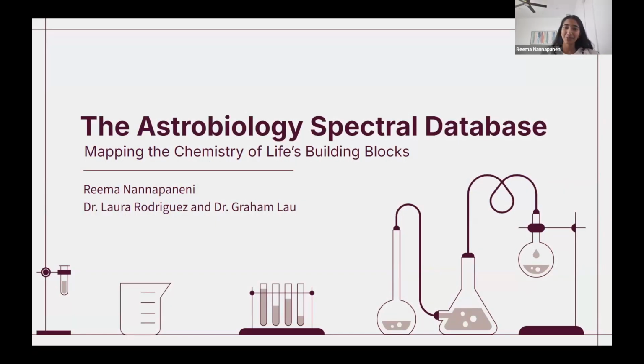Well, hi, my name is Reema Nannapaneni, and today I will be talking about the Astrobiology Spectral Database. I have been working on this project under my PIs, Dr. Laura Rodriguez and Dr. Graham Lau. The goal of this project is to organize spectral data relevant to astrobiology, along with the experimental and instrumental metadata necessary to interpret those spectra.